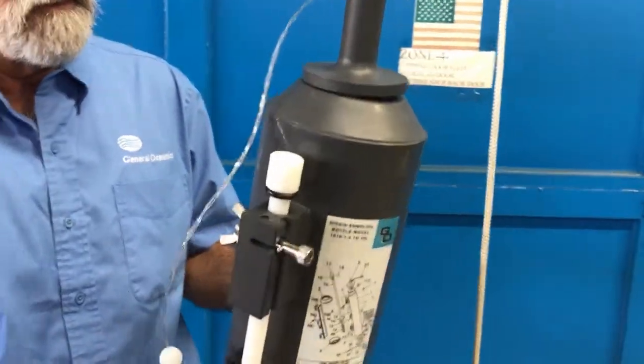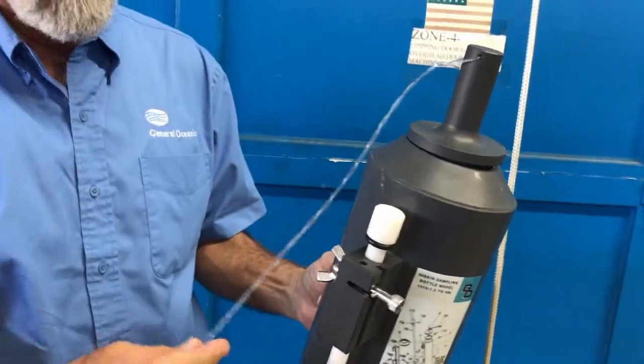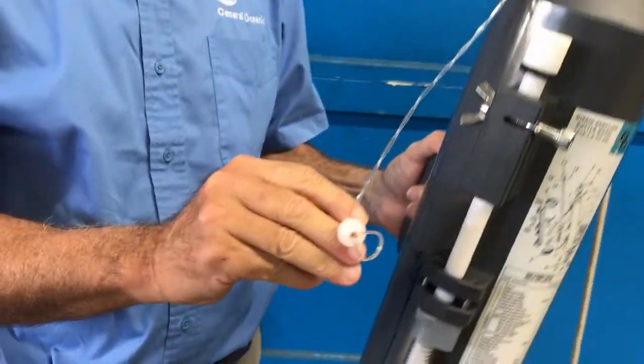Both end stoppers are equipped with lanyards made from monofilament line with copper crimp sleeves.